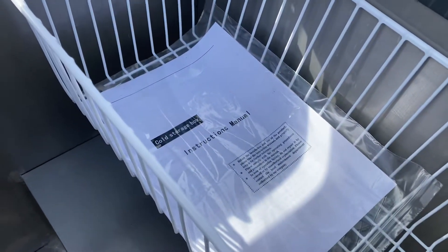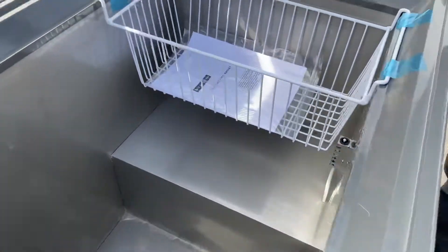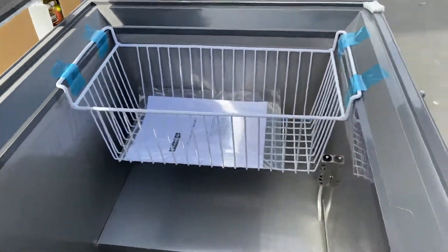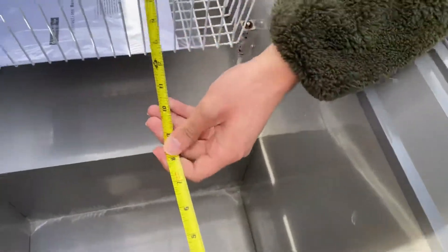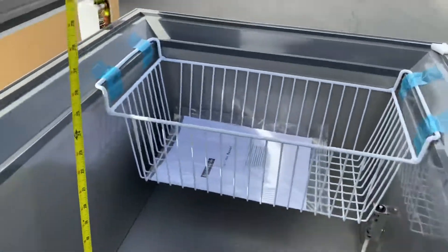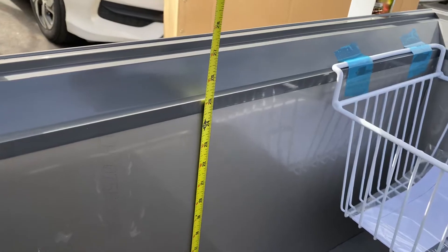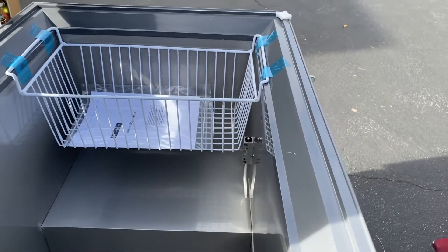If we go ahead and open this up, on the inside you'll see a basket that will be provided with this unit, along with an instruction manual. All the information on this unit will be in that booklet. For interior measurements, front to back is about 20 inches, left to right is 28 inches, and bottom to top is 24 and a half inches.